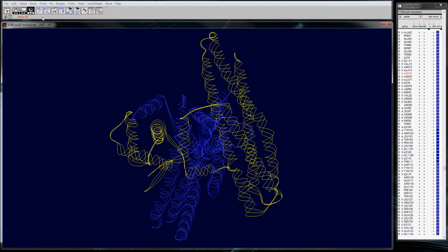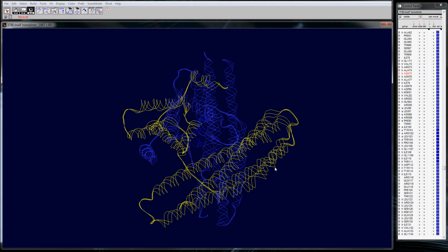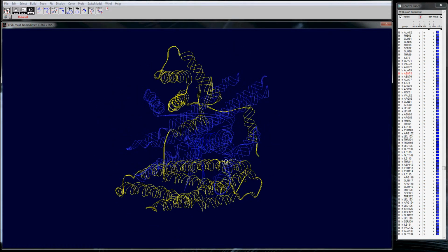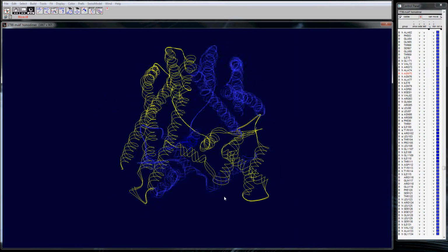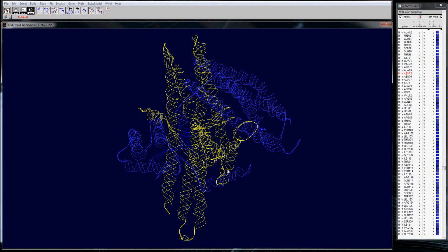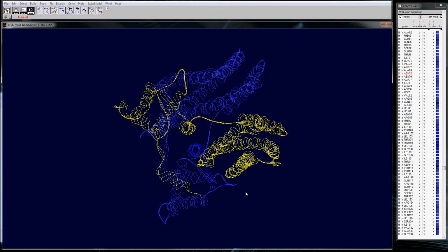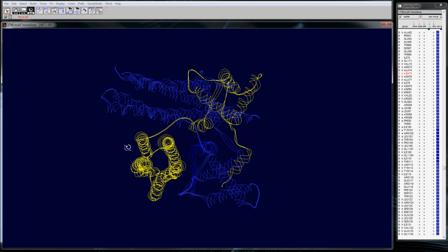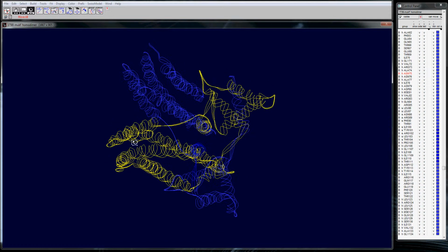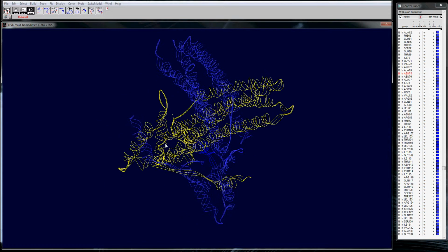And let's talk about another way to find interesting sites. So we've taken this structural approach where we investigate the structure of the protein, just by swirling it around and taking a peek at where the blue touches the yellow. And then we just looked at the amino acids in those regions and looked at the local side chains. But if we have an idea of the shape of an active site we want to make, the other option is to actually look for specific side chains.